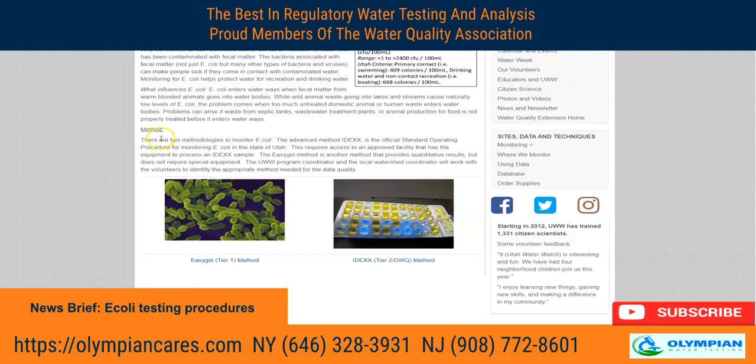So here is the method. There are two methodologies to monitor E. coli. The advanced is the IDEXX method, which is the official standard operating procedure for monitoring E. coli in the state of Utah. This requires access to an approved facility that has the equipment to process the IDEXX sample. The EasyGel method is another method that provides quantitative results, but does not require specific equipment. And the UWW Monitor Program Coordinator and the local watershed work together to identify and approve the methods needed.